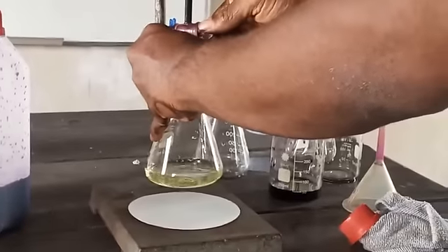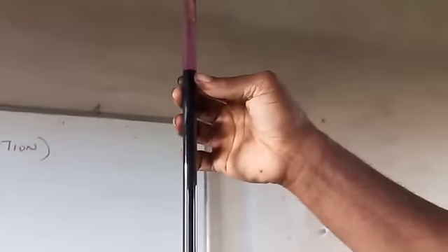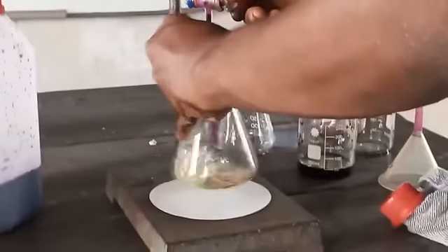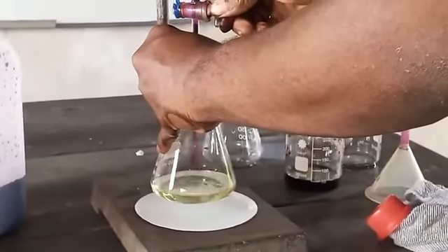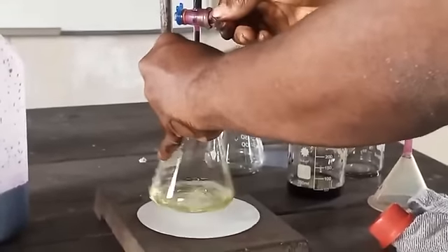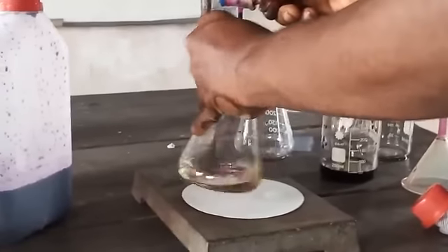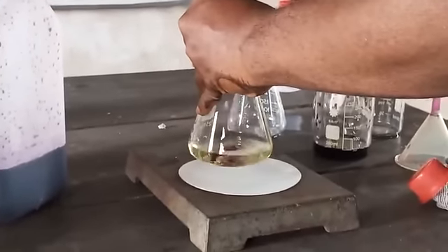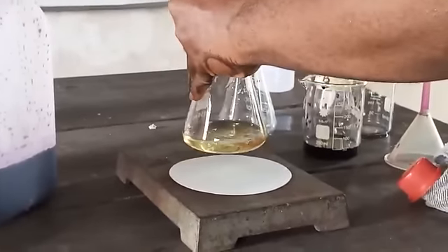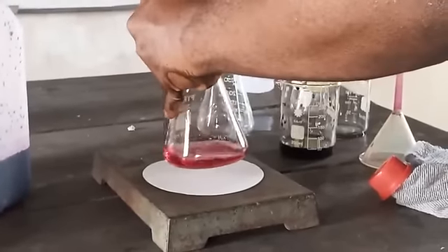Okay, we are past 6 a little. So view it, this is 6.1 or about that. 6.1. So we're going to take it easy now. Drop by drop until the color changes. Our focus will be on the burette. I think it's about changing. You see, almost there. We need one drop.